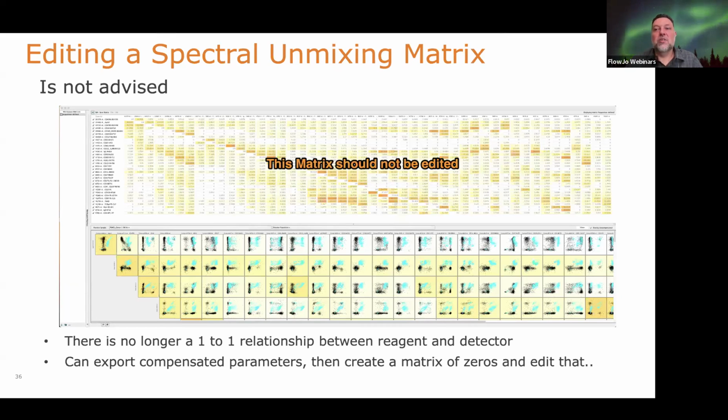So think about that when you're designing your experiment. You have an intent in mind to look at a specific set of features on the cells, and you want to use the instrument that is conducive to making really nice, pretty readouts. I've seen some data on spectral versus traditional instruments, and it's so wonky and uninterpretable on one, and really good on another. Like, why force it? Just use the one that's easiest to get the answer and has the cleanest data to make your biological conclusions.